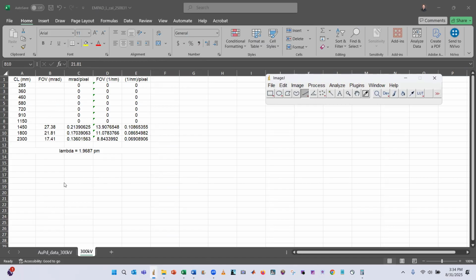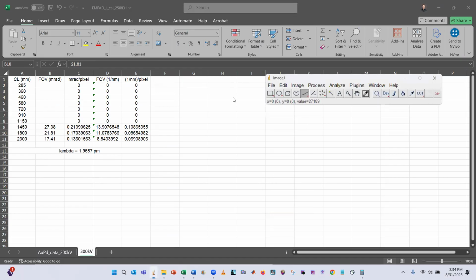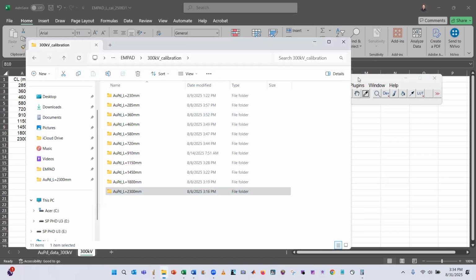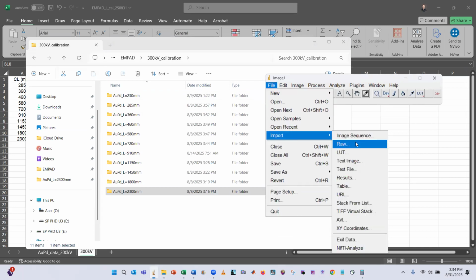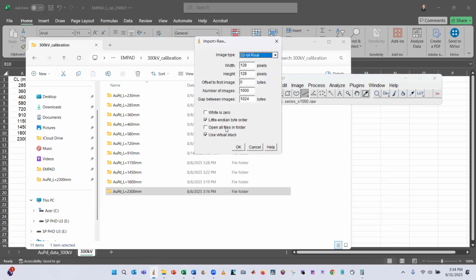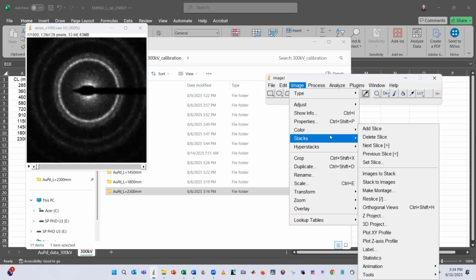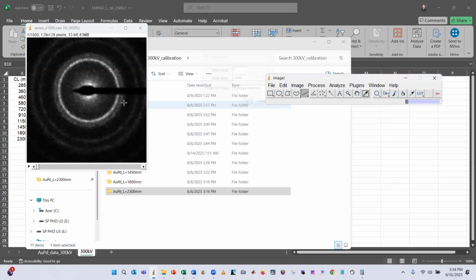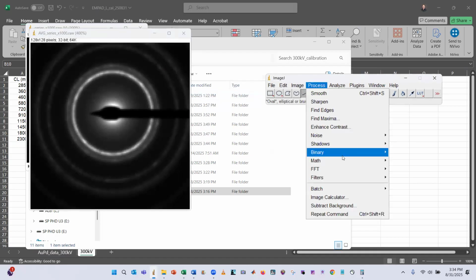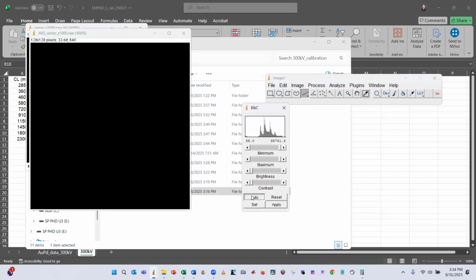And let's do 1150 here. Oops, sorry. It did open recent for me. Okay, stacks, Z project, average, math, process math log, Control Shift C. There you go, auto.